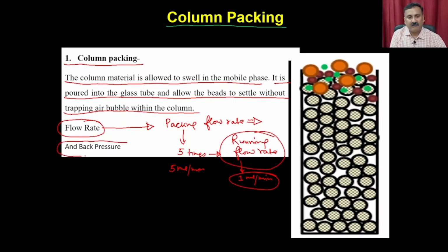And then you also have to see the back pressure. So back pressure also should be compatible with the protein purification system you are using. And we have prepared a small demo clip so that you can understand how to pack a column and how to run the gel filtration chromatography.